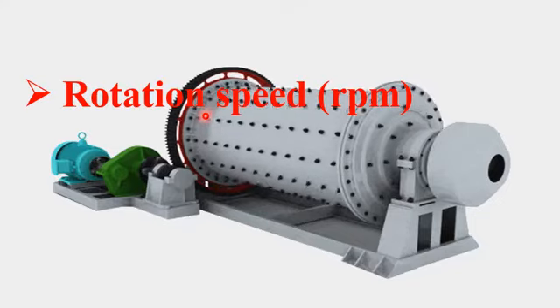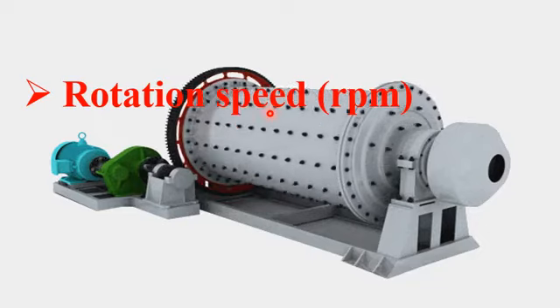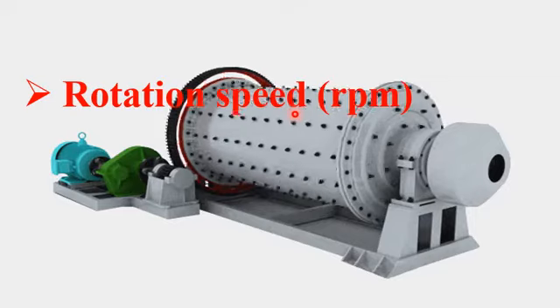If the rotation of the drum in the opposite direction to the revolution is effective in fine grinding of the material, mechanochemical activation of the material, and also mechanical alloying, it is due to the larger impact energy of the balls during the milling process.